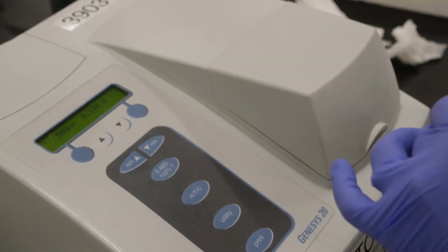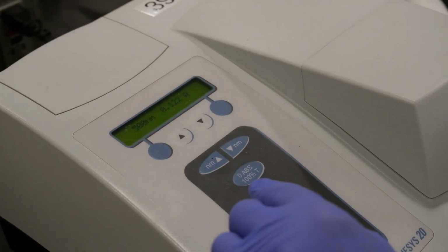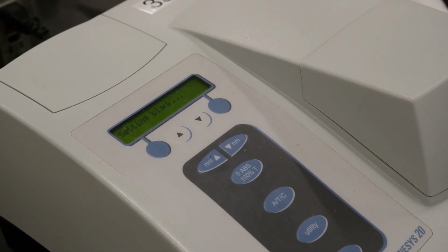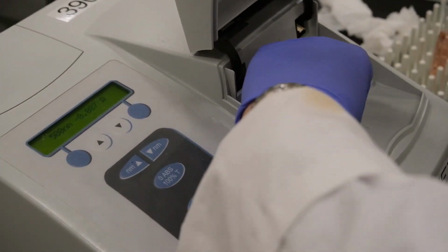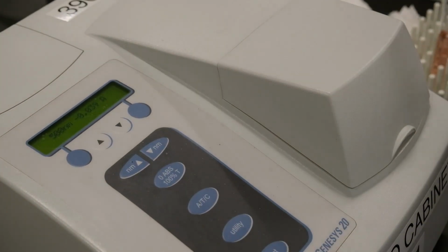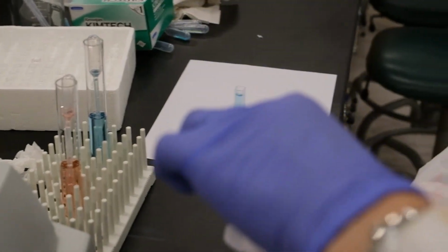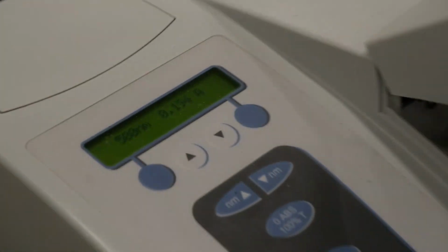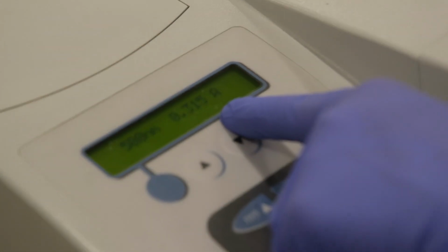So first, as always, we set the blank, and then we measure the absorbance of the Allura red that we separated from the Kool-Aid. This is the value.